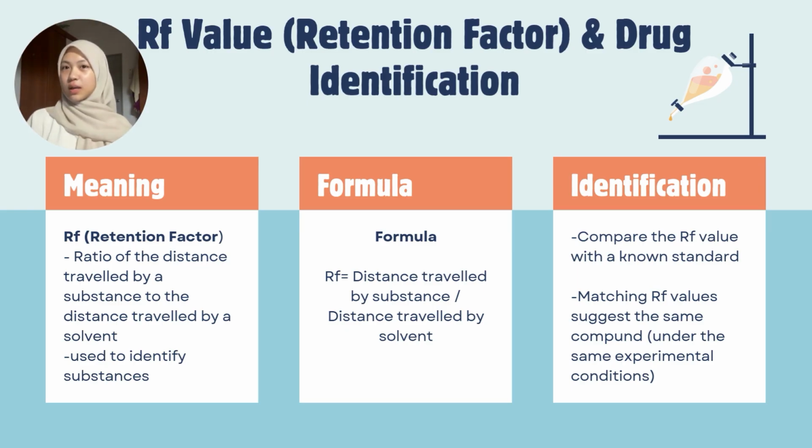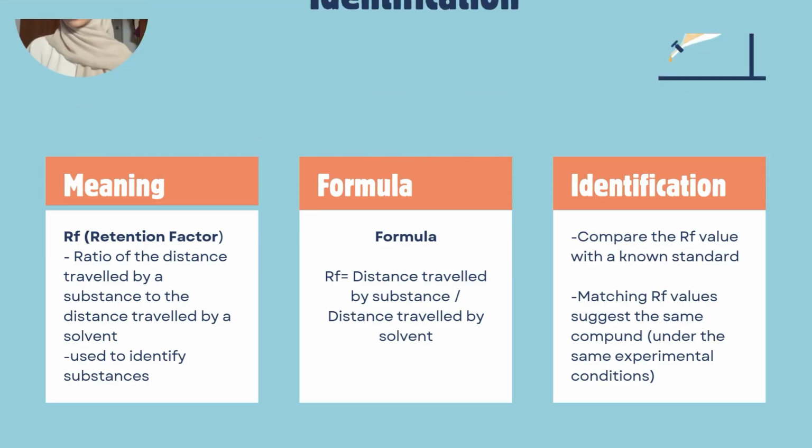In conclusion, the RF value is a simple but effective tool in chromatography. It plays an important role in identifying drugs, checking the purity of pharmaceutical products, and analyzing unknown substances in laboratories.